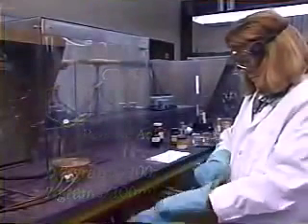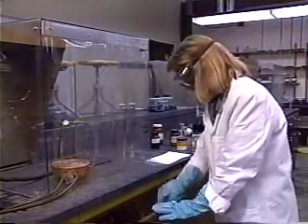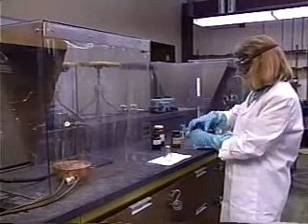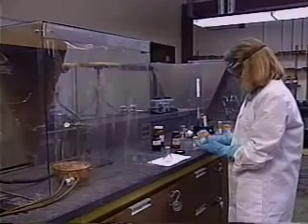Our demonstrator will recrystallize a small amount of benzoic acid. It is a good practice to recrystallize only a portion of your compounds in the organic chemistry labs. This saves on both solvent consumption and waste production.